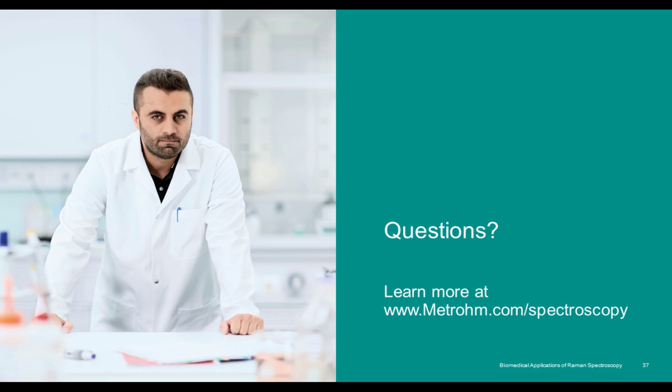Wonderful. Now, our next question. Is there a limit on the excitation wavelength to use in Raman spectroscopy?